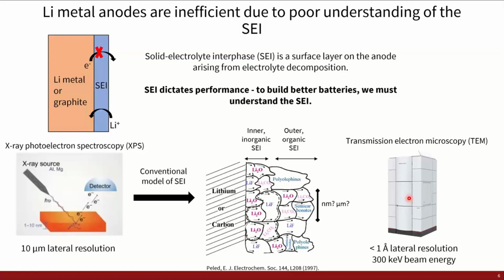This has also been described in a paper in ACS Nano. I don't remember the exact reference, but basically they found that the damage cross-section of lithium is lowest at higher accelerating voltages. So for cryo-TEM of battery materials, you might actually be better off with a higher accelerating voltage. But for other systems, it may differ as well.